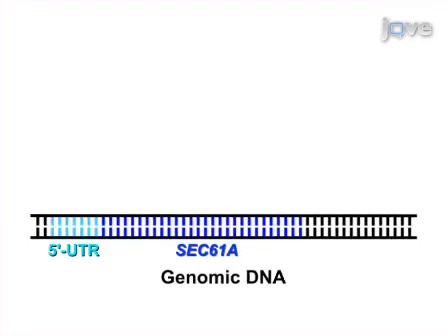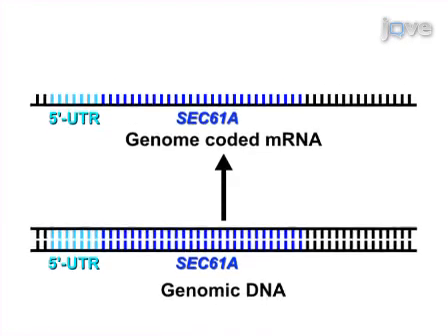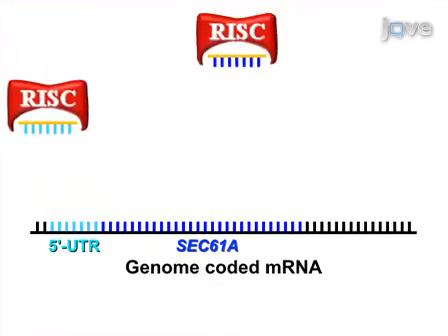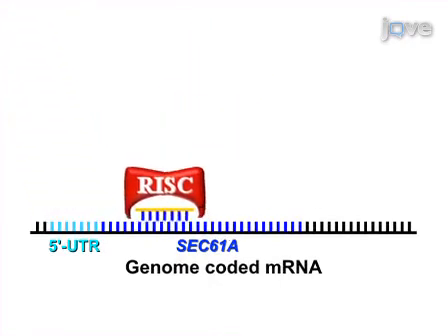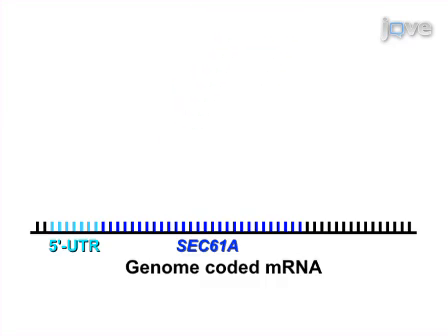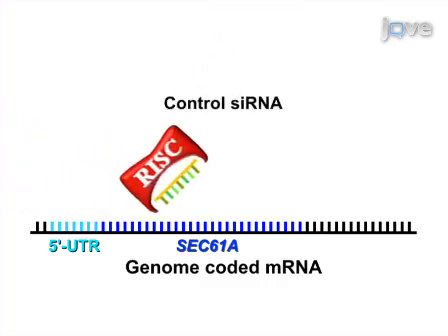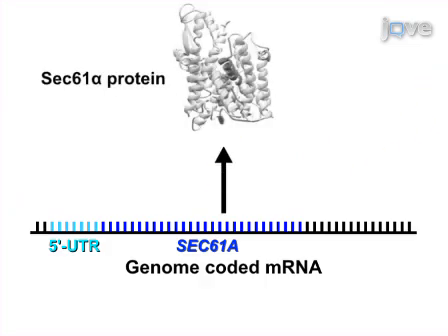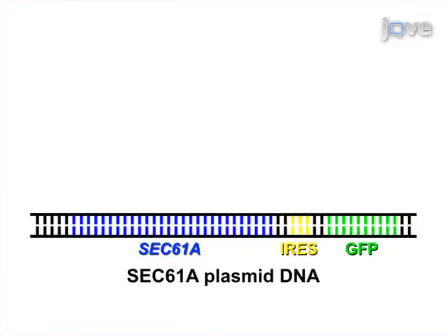To reduce the risk of studying off-target effects of a particular siRNA, 2 different siRNAs are used to silence each gene. To assess possible side effects of the transfection procedure, negative control siRNAs, which are composed of a random sequence of nucleotides, are transfected in parallel with the experimental siRNAs. It is important that the effective siRNA-mediated silencing can be rescued by expression of wild-type cDNA.